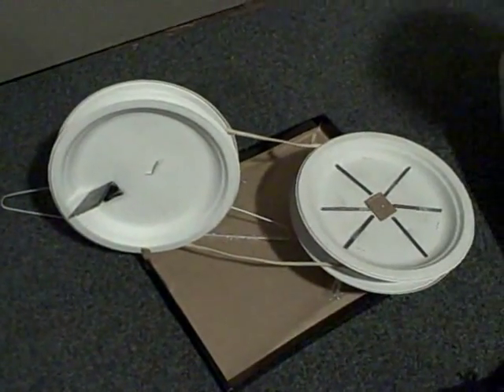Actually, Kevin should operate because he's on the side of the vehicle. This is our centrifuge.